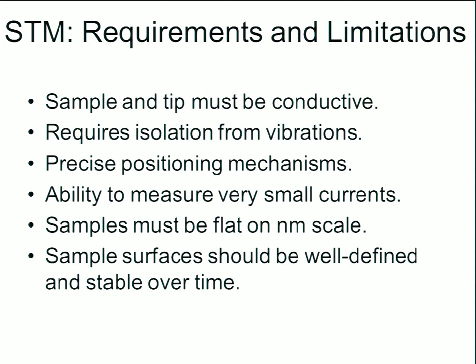It requires the ability to measure very small currents. Well, we have that in an STM. And samples must be very flat. Can't say atomically flat, but definitely on a nanometer scale they need to be extremely flat. Sample surfaces should also be well defined and stable over time.